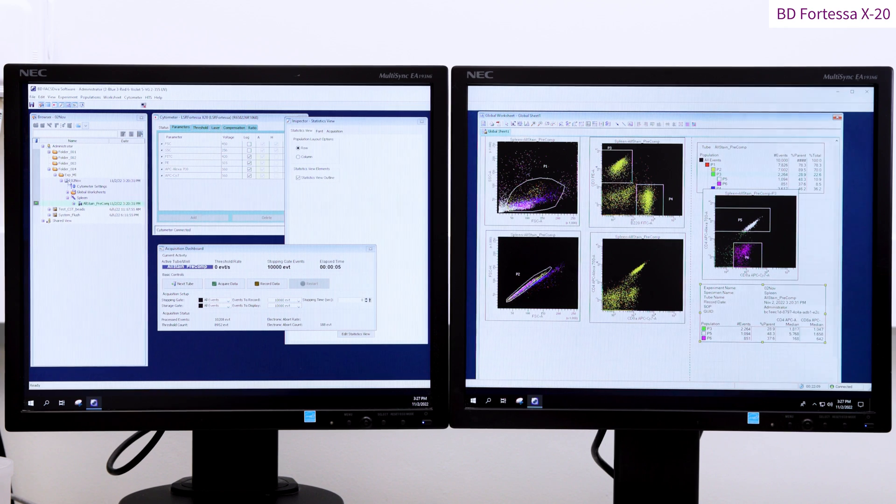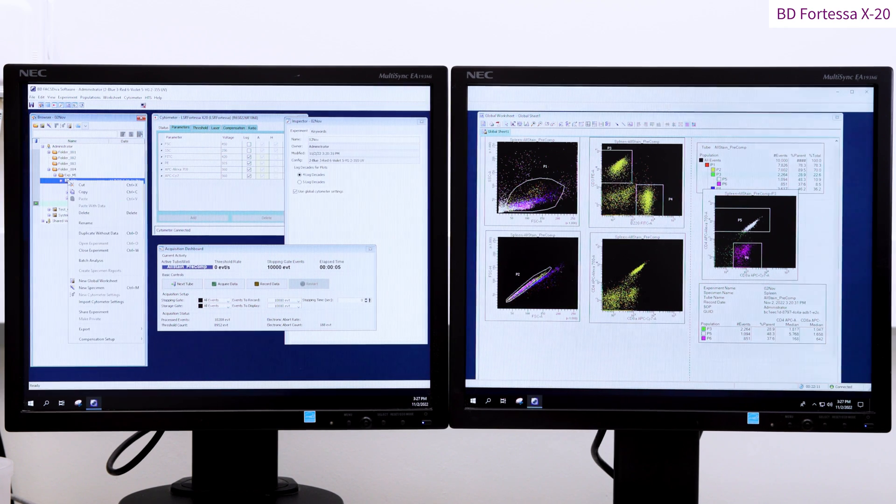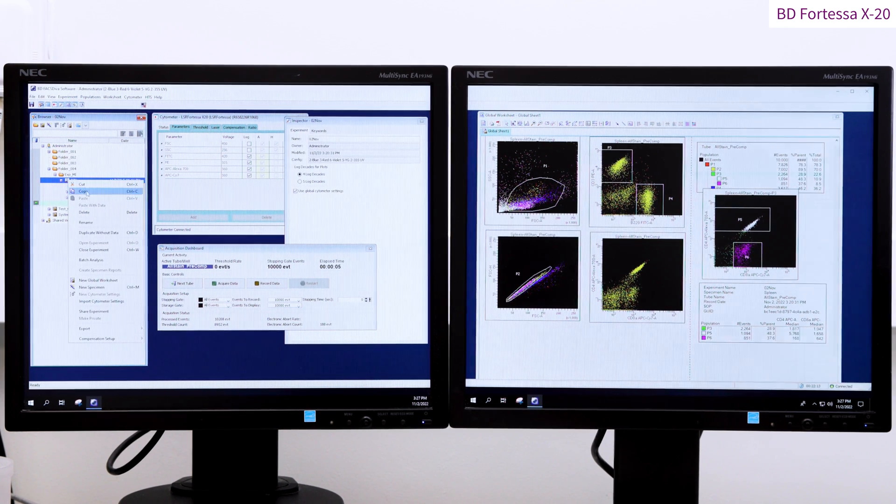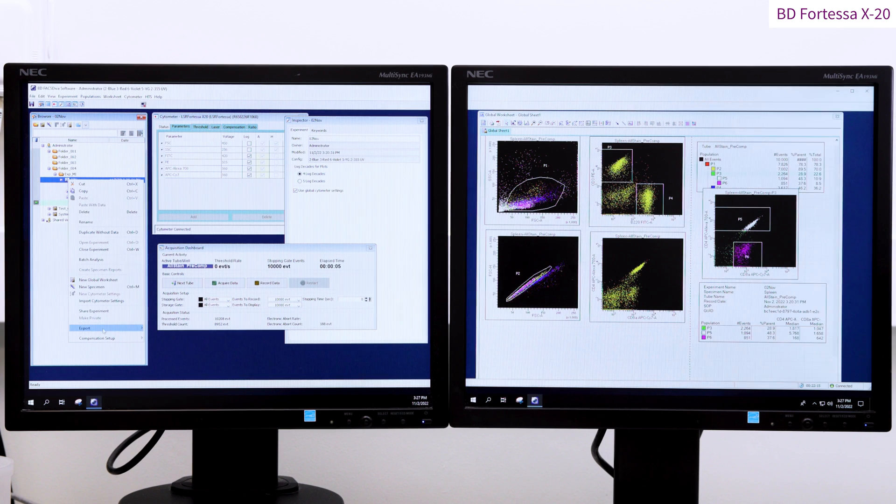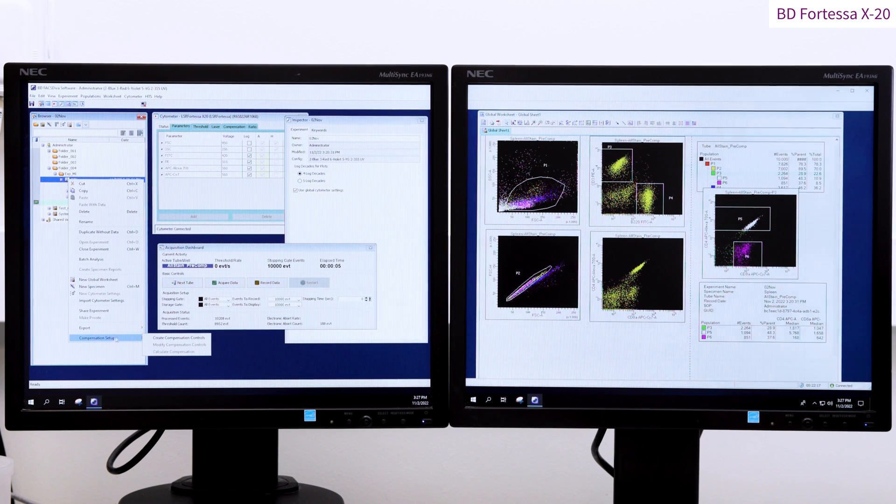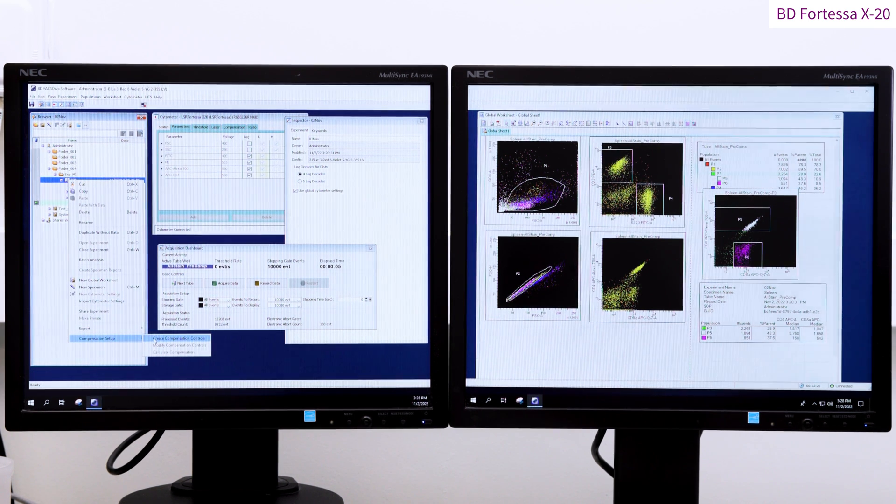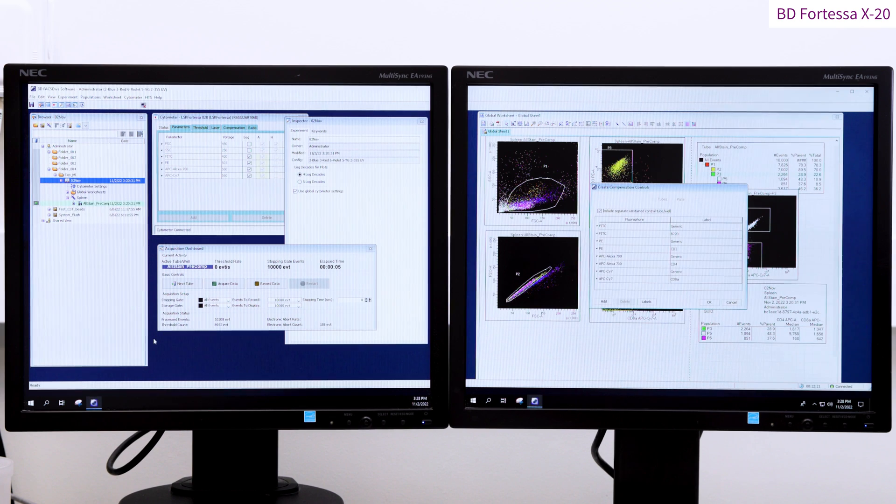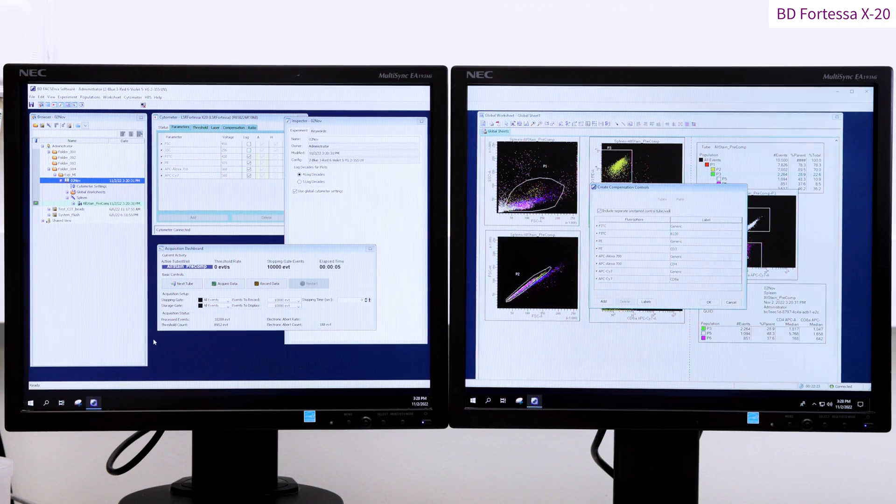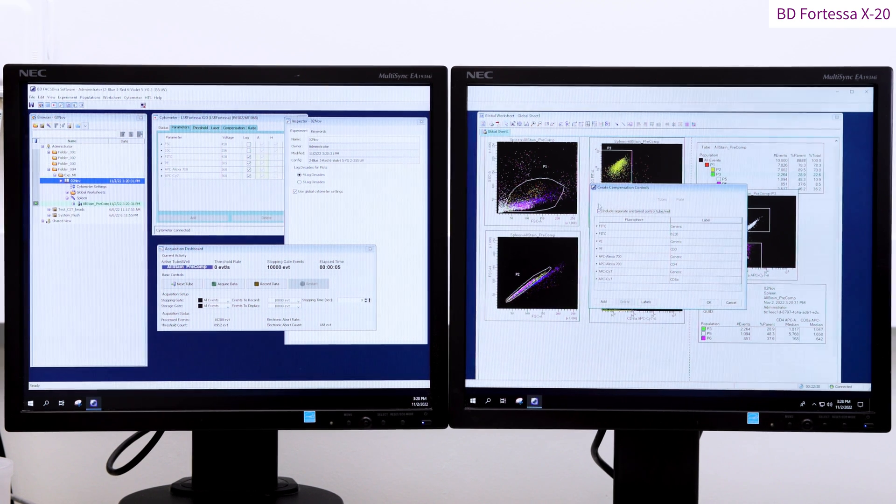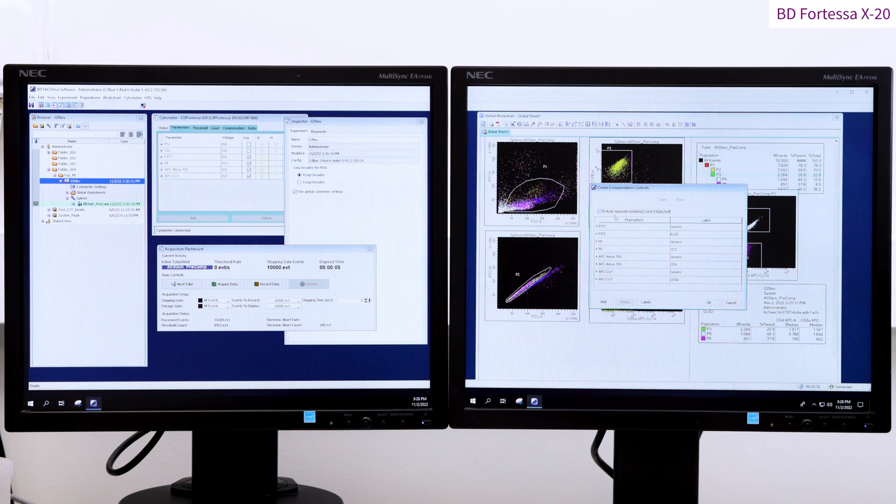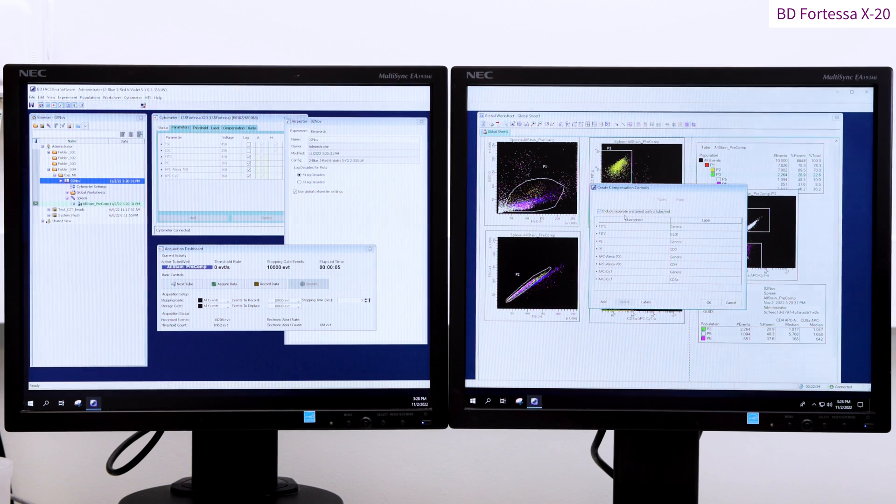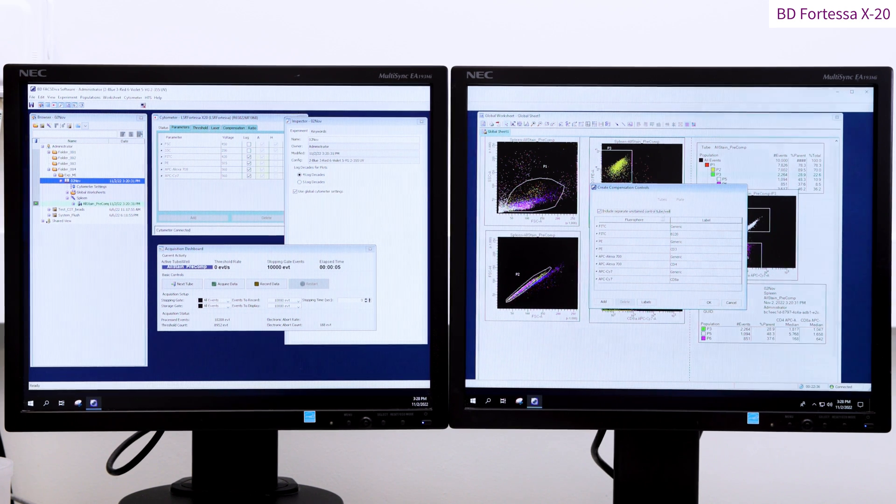We will now set up an automated compensation matrix calculation. Right click on the experiment folder, go on to compensation setup and create compensation controls. The create compensation controls table appears. You can tell Diva if you have an unstained sample or not by the tick box located on the top left corner.